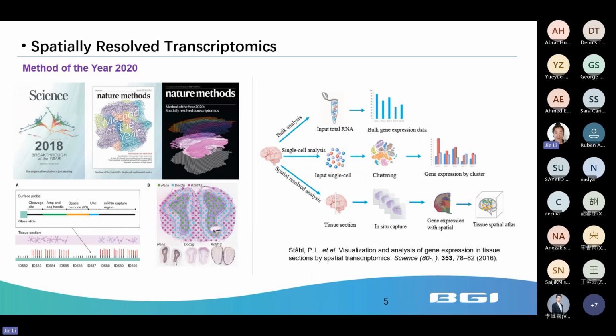And last, with spatial transcriptome technologies, we can pick up the spatial information, which further promotes the study of accurate gene expression of cells in their tissue context. Moreover, the combination of single cell transcriptomes and spatial transcriptomes for joint research allows the study of gene expression at spatial locations to be integrated with ultra high resolution and single cell levels.